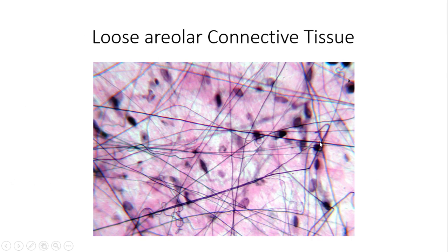You're going to see all these fibers, and actually that's what's important about connective tissue, it's always full of fibers. Okay, so you see all these little fibers moving across, and there's these very little pink ones in the back too, not as darkly stained, but that's the point. They're different types of fibers, therefore some stain lighter, some stain darker. But you're going to see all these, it almost looks like a webbing.